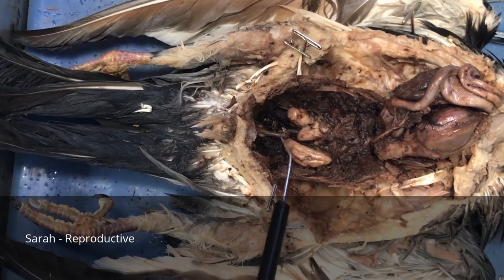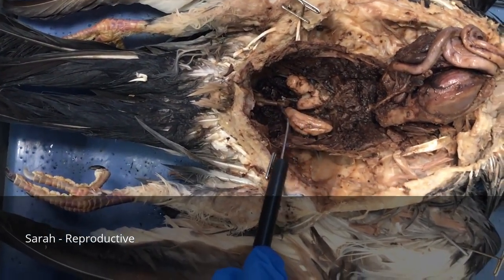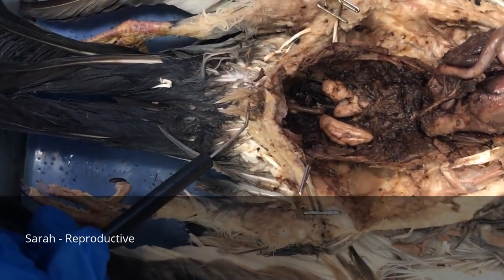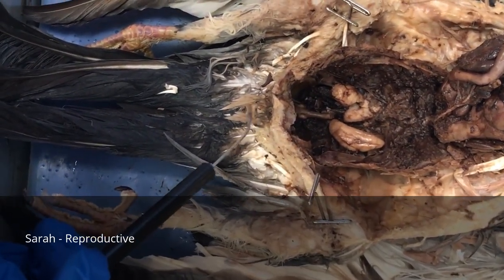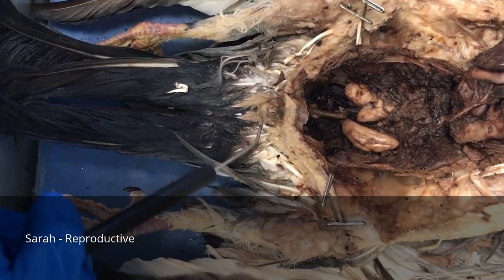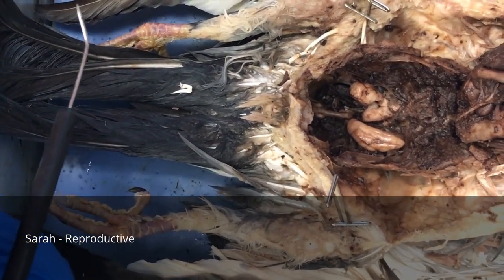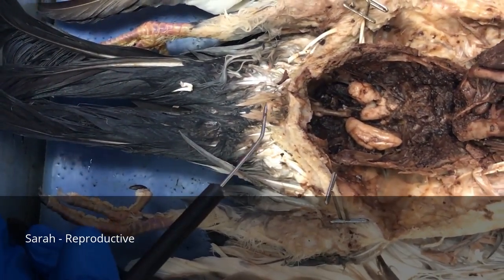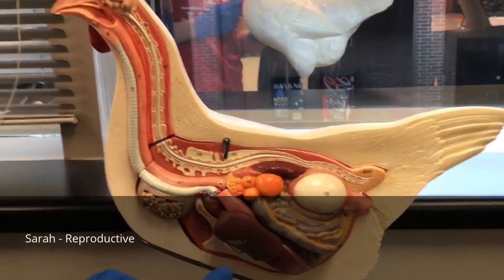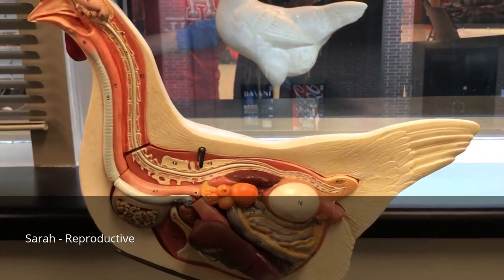Birds mate through a cloacal kiss, meaning that the testes that produce sperm will go through the cloaca of the pigeon, and both the cloaca of the male and the female will make a kiss. It's a strange term, but that is internal fertilization for the pigeon. And since we had a male pigeon, I'm going to use our chicken model, which is obviously a female due to the presence of the egg.